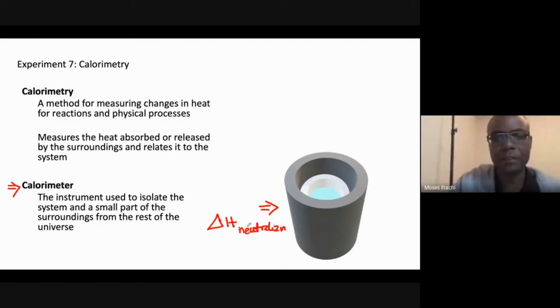But you can find heat of fusion, heat of vaporization, latent heat, lattice, all those. For the calorimeter, you're going to have a double cup. We would have used styrofoam. So you're going to have a small cup inside a bigger cup. Why? We need insulation. The reason why we have 2 layers of cups is because we need insulation.